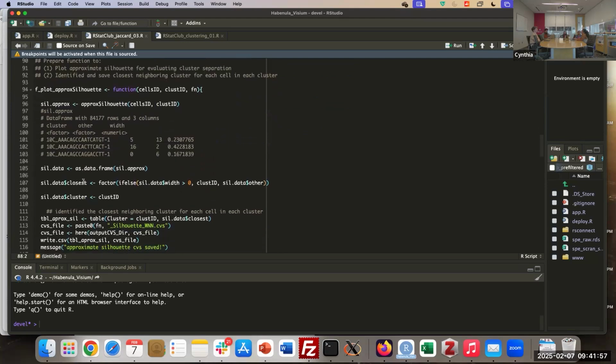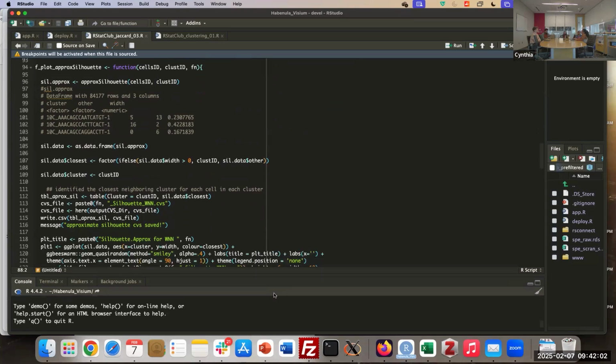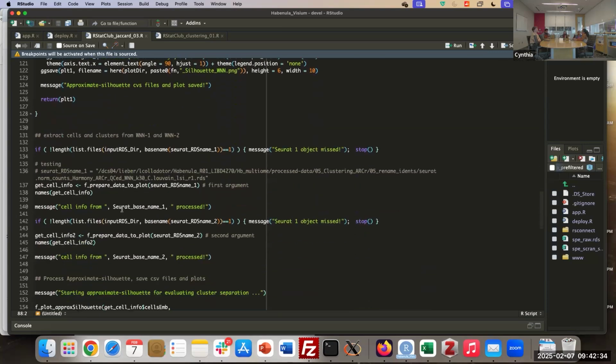And well, the second step. One of the recommendations that I can give is that it's sometimes difficult to read these plots because they are composed of a lot of colors that I really cannot distinguish. So I used to pull the data frame and save it as a table in order to go back and forth and check, so I'm not just trying to figure things out, but I can see the numbers and see what is the percentage of the approximation of the clusters without guessing too much.